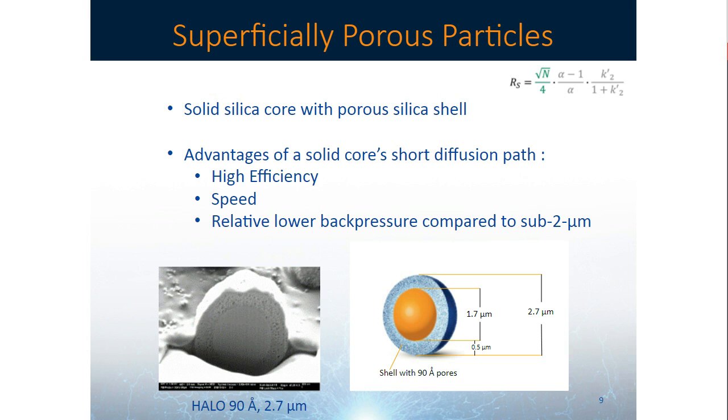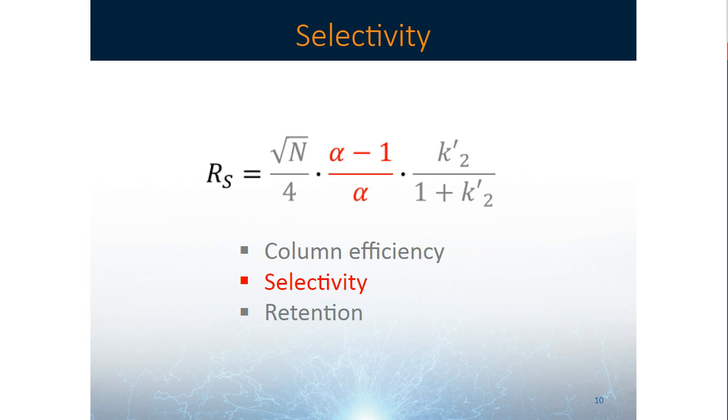So now, going back to the selectivity term of the resolution equation, the reason that we're very interested in selectivity is because resolution is almost linear with selectivity. So the better your selectivity is, the better your resolution is going to be.